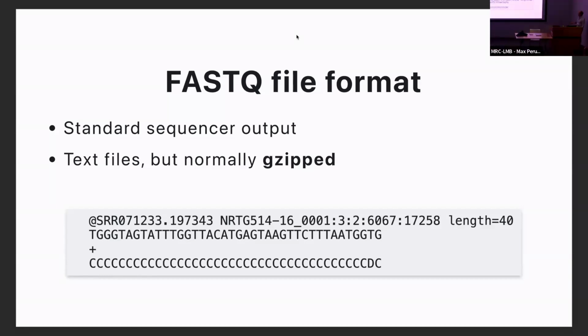And what you can probably expect is that's the nucleotide sequence of the read. So it's literally just the AGCT sequence. If there is any ambiguity regarding a base call, you'll get an N in there as well. So that will be the 5th letter. So what are these extra lines? You've got a row of C's here.